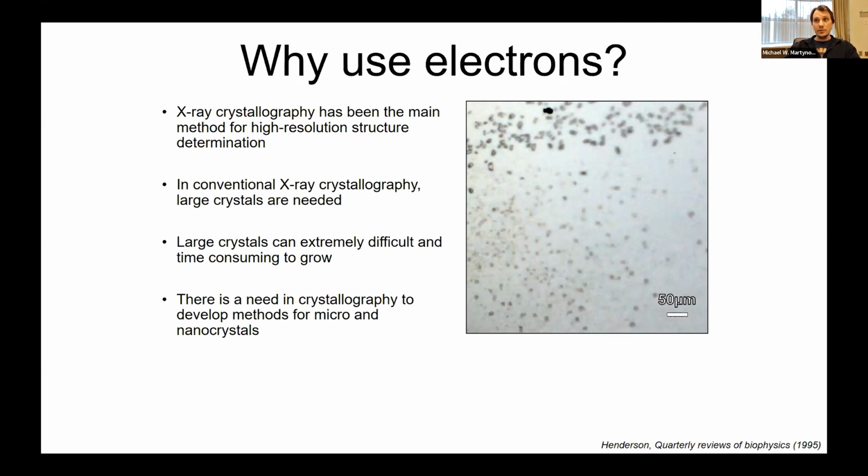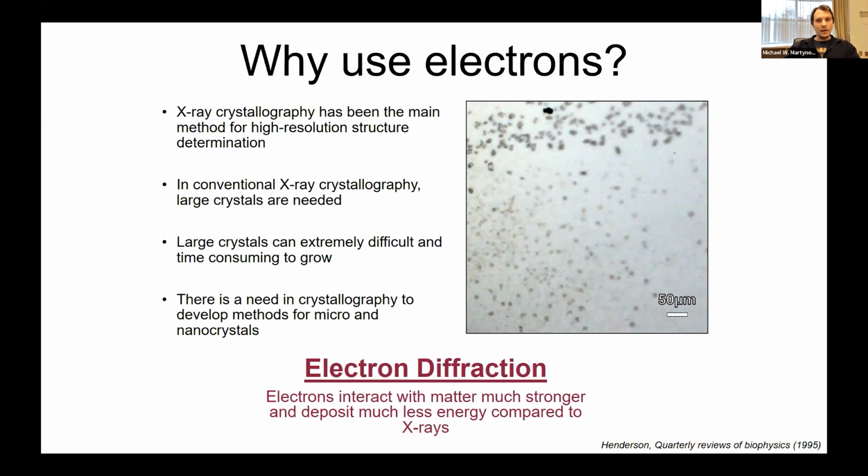So we decided to go to electrons and use electron diffraction because electrons interact with matter orders of magnitude stronger than X-rays do. And on top of that, they deposit less energy, which means there's less radiation damage.